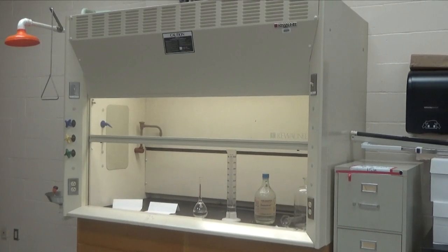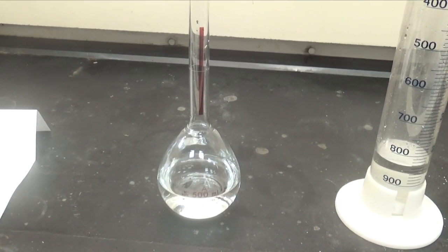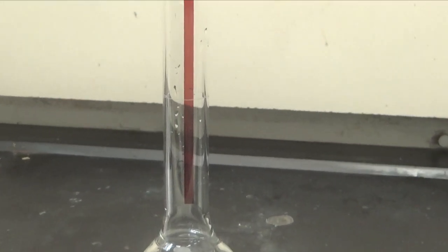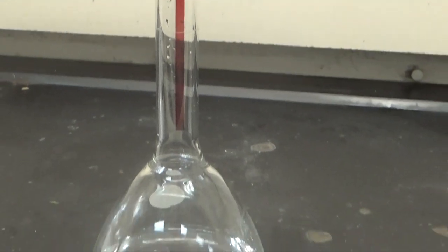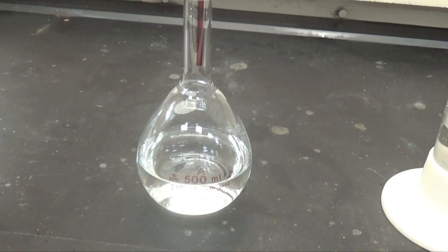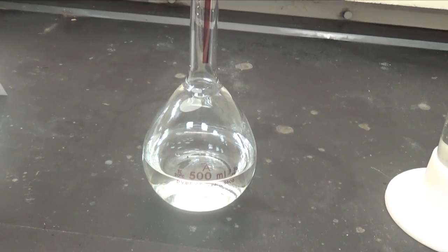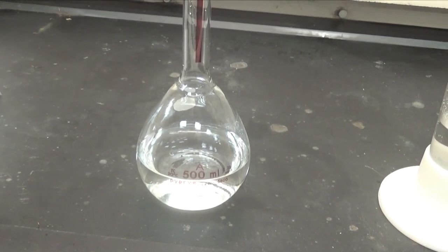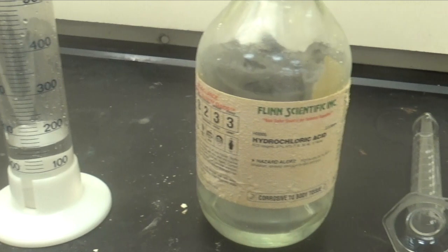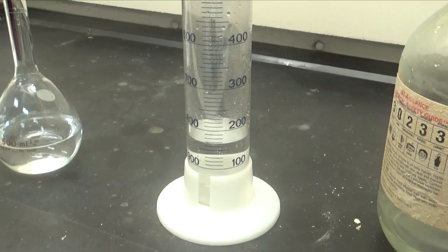Now let's head over to the fume hood to make this solution. This is a 500 milliliter volumetric flask. Notice that this flask has one line on it, and that line indicates the 500 milliliter mark. I've also placed some distilled water in this volumetric flask, and the reason I did that was because whenever you're diluting concentrated acids, you need to put water in the flask first, then add the acid to it. I also have measured out 167 milliliters of the concentrated hydrochloric acid. I'm now going to pour the acid into the flask.